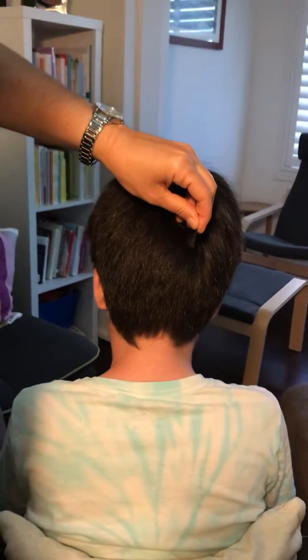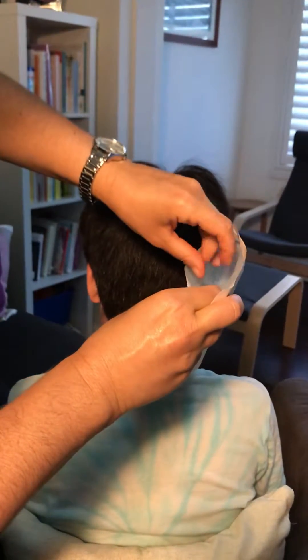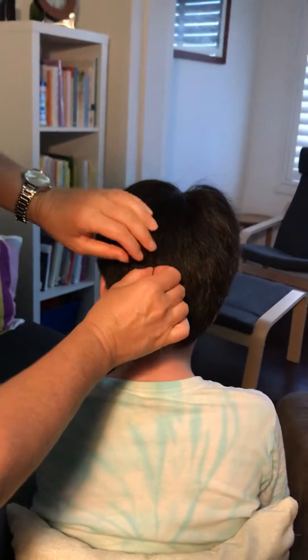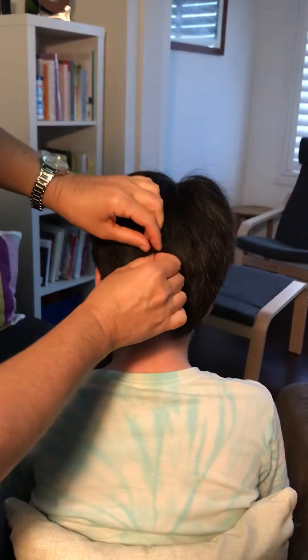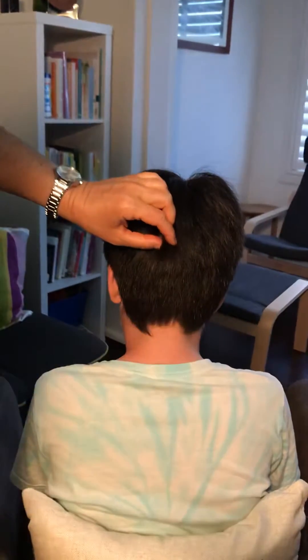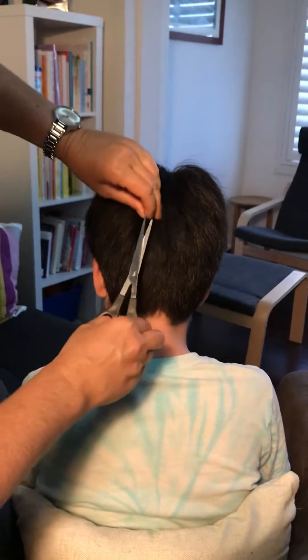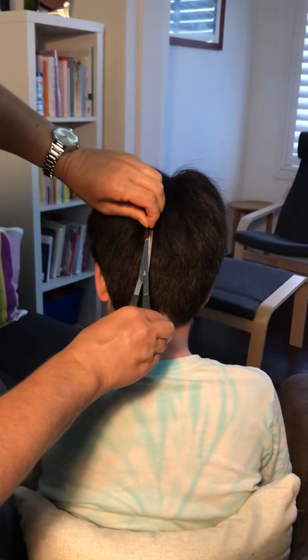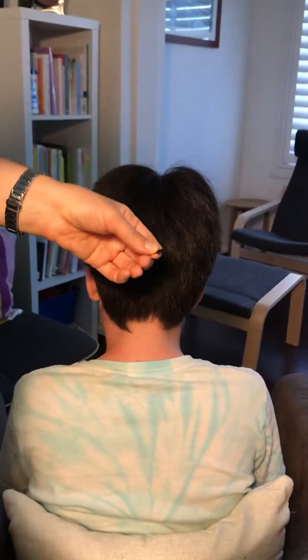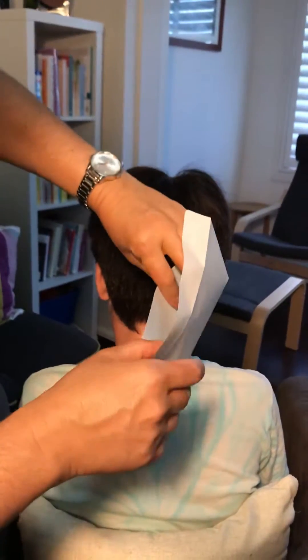Pop it into a plain envelope. That was about half a teaspoon of hair. It's good to get samples from a couple of places at the back of the head — it has to be at the back of the head, just remember that. Go really close to the scalp, cut a little bit there, and pop that into the envelope.